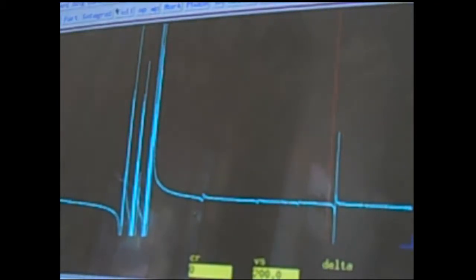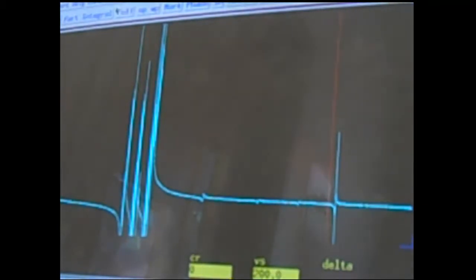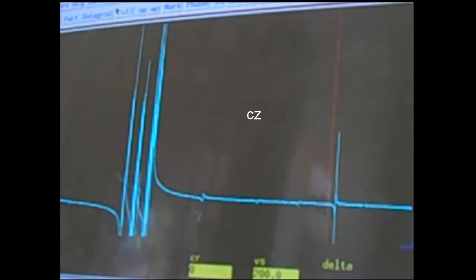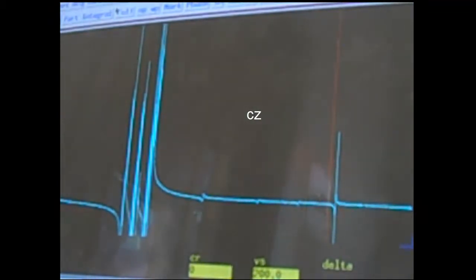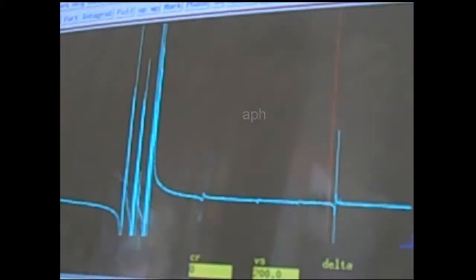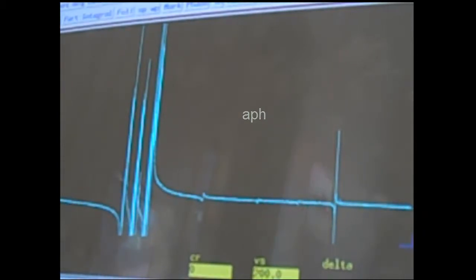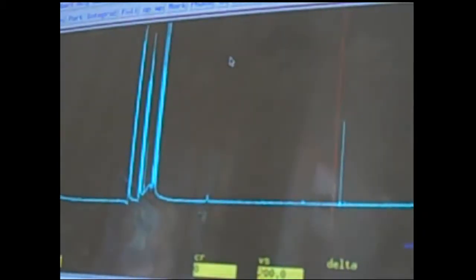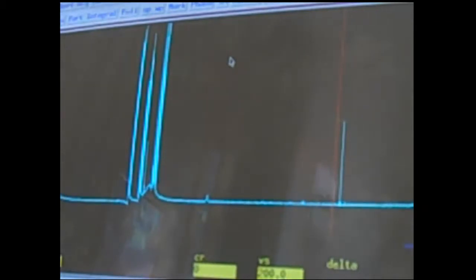The sample just finished running and we can see our raw spectrum. At this point the job aid asks you to enter a series of commands to process this so it looks like a usable NMR. The first thing is CZ. By typing in CZ and then hitting enter, that clears off any previous integration values. The next is APH. By typing in APH and enter, your spectrum will be auto-phased.